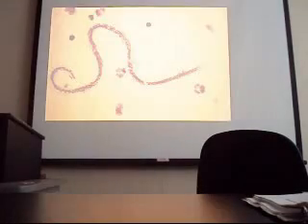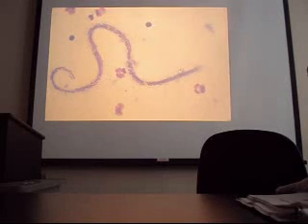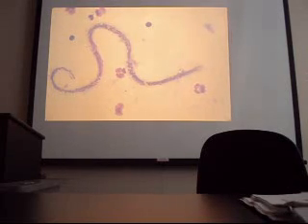Elephantitis. They'll be purple, they'll be in a blood smear, they'll be much larger. Find them with low power first. On all your microfilaria, remember we're only knowing 4 microfilaria: Wuchereria bancrofti, Brugia malayi, Onchocercus and Loa loa.